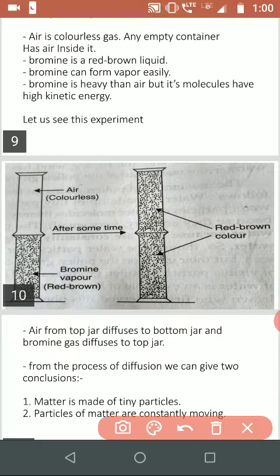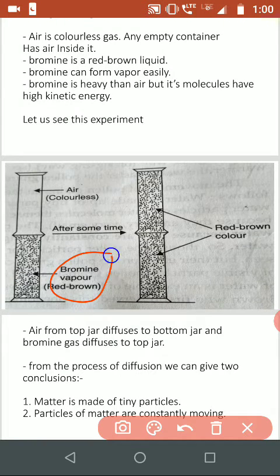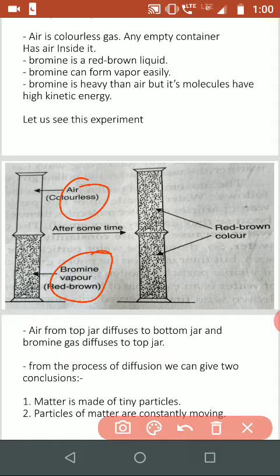In this experiment we are going to take Bromine Vapor, which is red-brown in color, and Air, which is colorless. In the bottom jar we have taken Bromine Vapor and in the top jar we have taken Air. After some time you will observe that both jars have red-brown color. Now, Bromine Vapor is heavier than air molecules and has lots of kinetic energy in them.